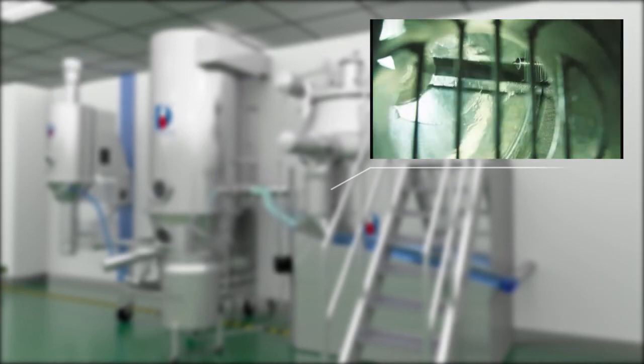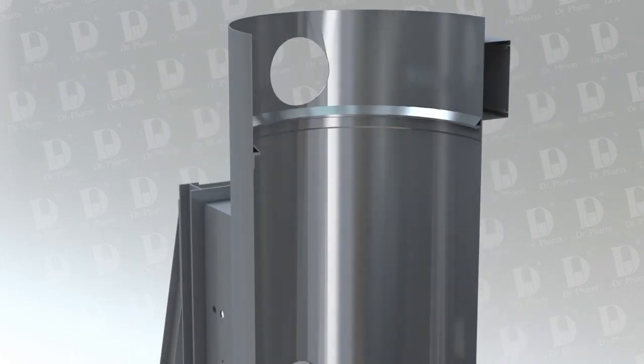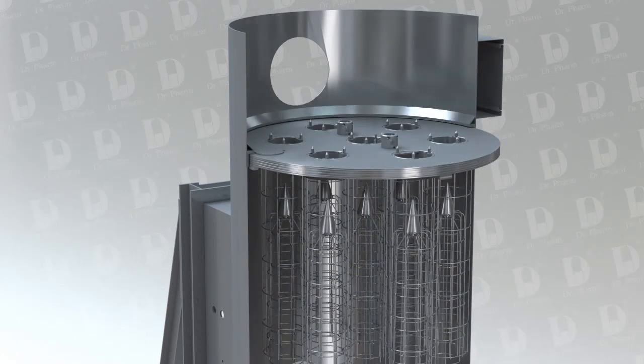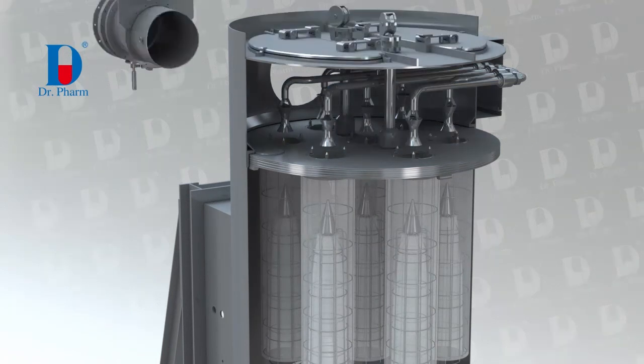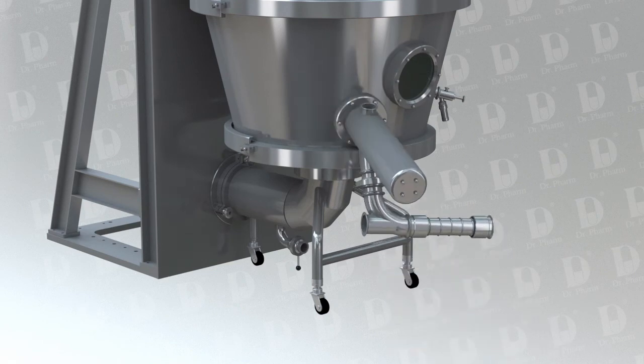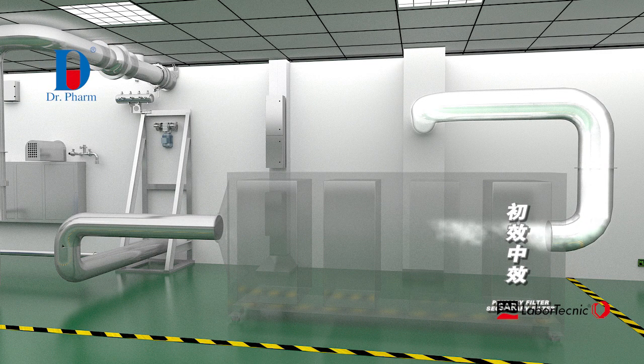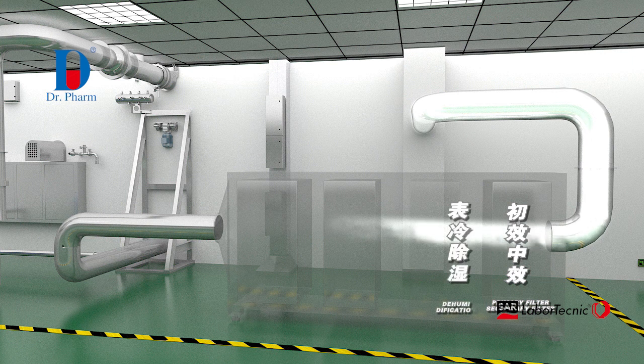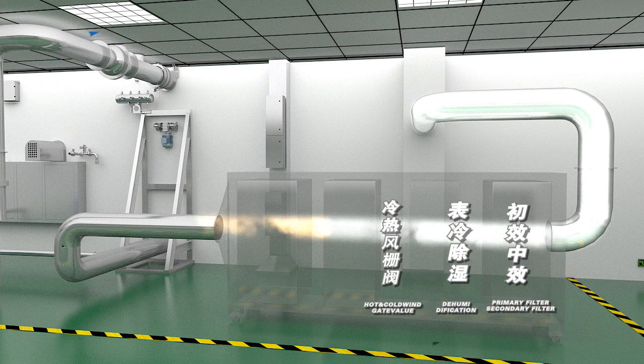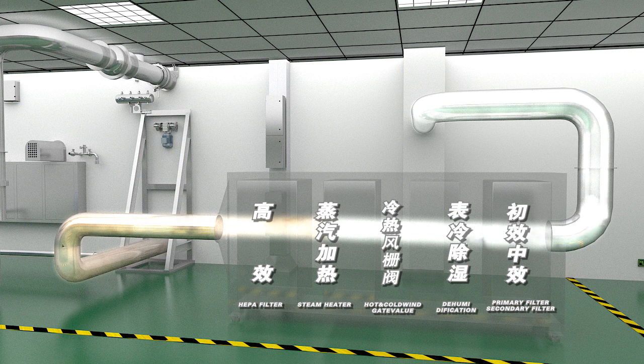The fluid bed dryer is simple in design and adopts through wall installation with high performance and multifunction. One equipment can not only realize the drying function but also realize the functions of one-step granulation and bottom spray coating for pellets according to customer requirements. The air inlet system consists of primary filter, secondary filter, cooling dehumidifier, face and bypass heat, and high temperature resistance HEPA filter. Inlet air temperature control accuracy is not more than plus or minus 1 degree Celsius.